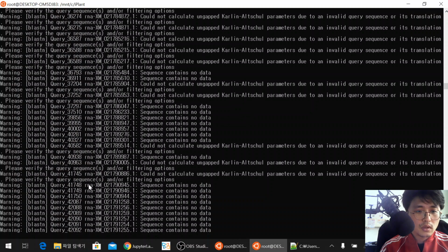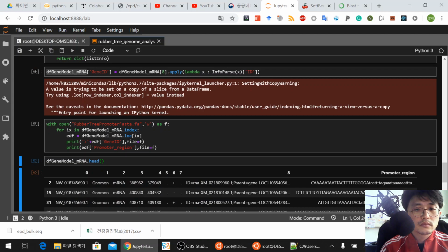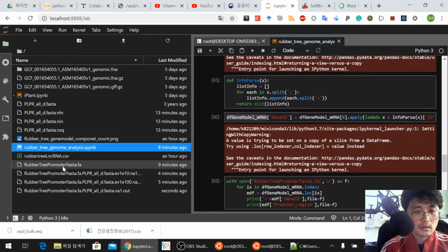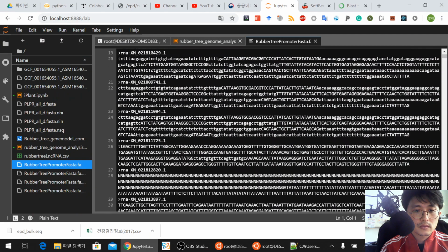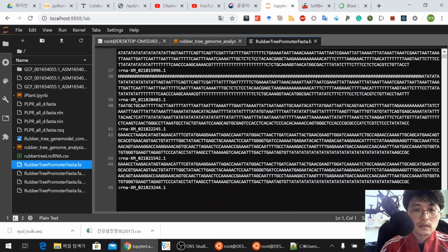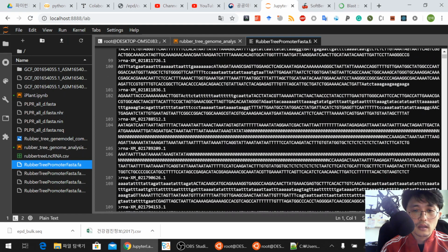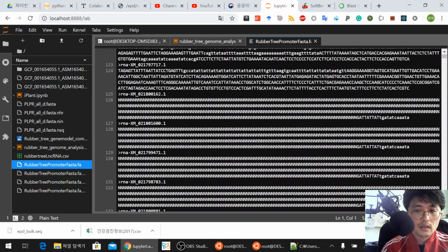Sequence contains no data. Let me check. Let me check. So this is our data. Aha. Some data have a lot of Ns in there. This is why it gives us this.